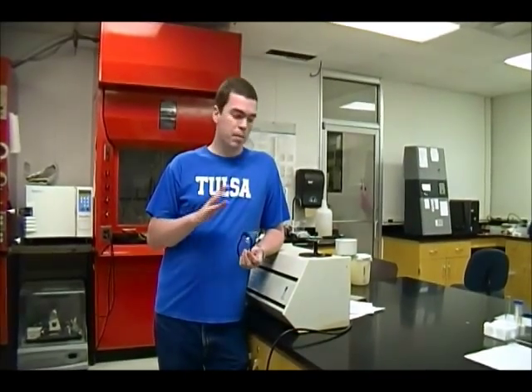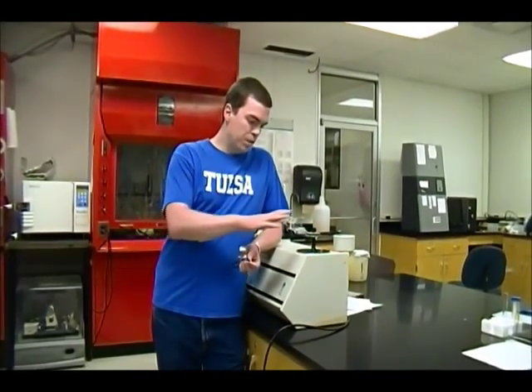Hi, welcome to the video for the PCHM-1 lab experiment solution calorimetry. In this video, I'm going to be going over the basic experiment you're going to be running, showing you the instrument you'll be using, and just the general procedure that you'll be going through.